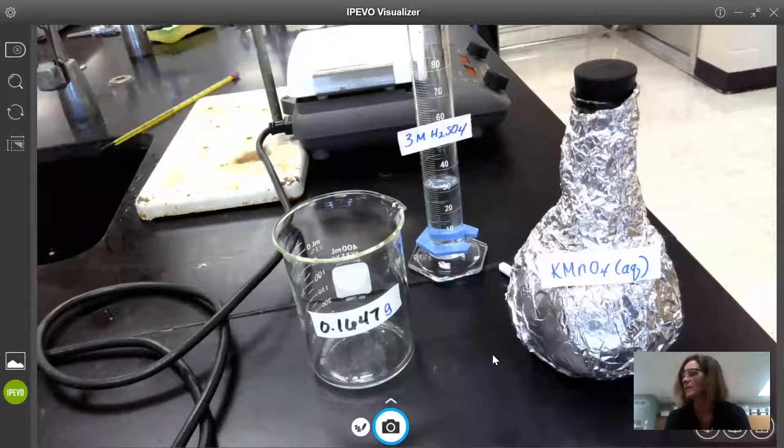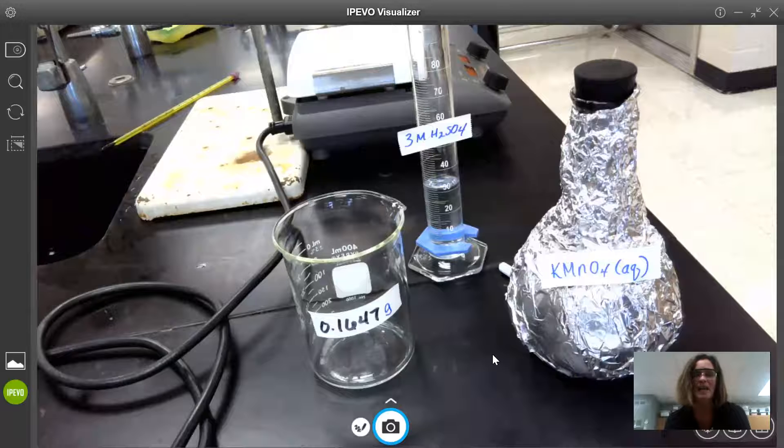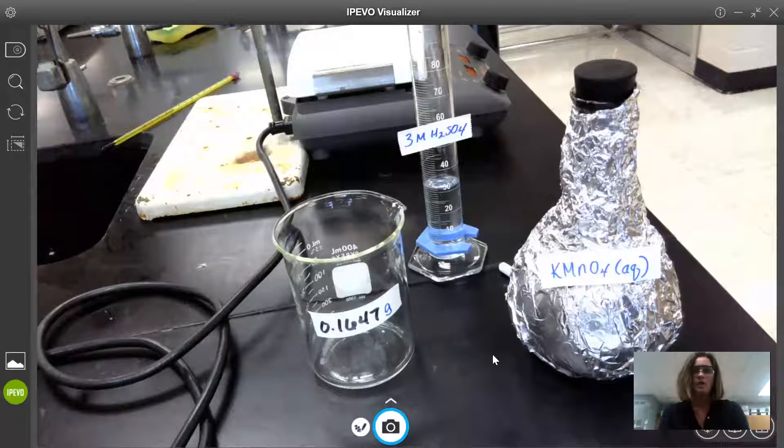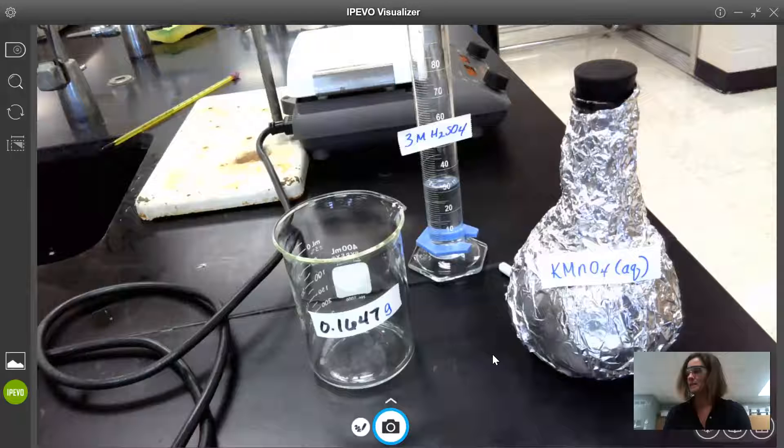Hi everyone. Today we're going to standardize our KMnO4 solution using the primary standard sodium oxalate.